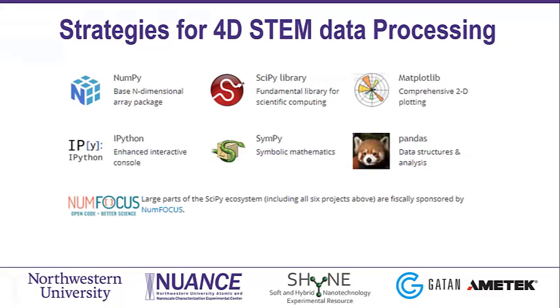Stephanie will talk in more detail when she shares the Jupyter notebook. She'll use mostly SciPy libraries like NumPy and Matplotlib for plotting. That's where you want to start.